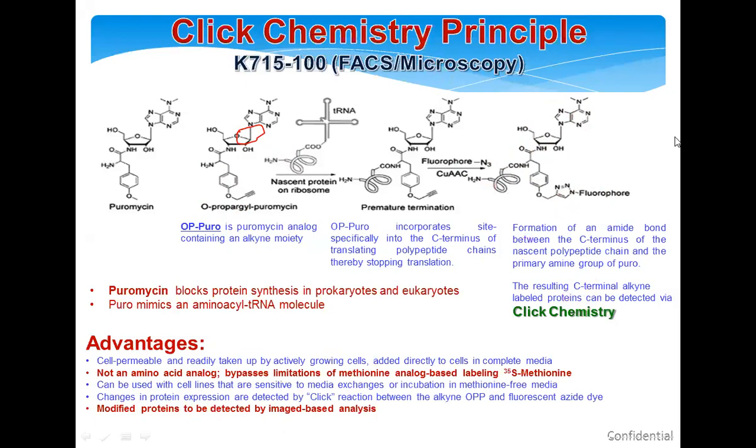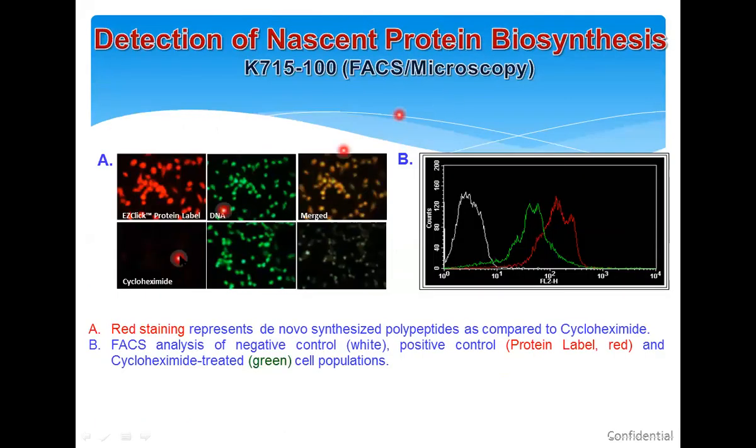In the next slide, I'm going to show you some data. Panel A is immunofluorescence imaging. The top panel shows the newly synthesized protein, which is labeled in red. We also labeled the DNA.